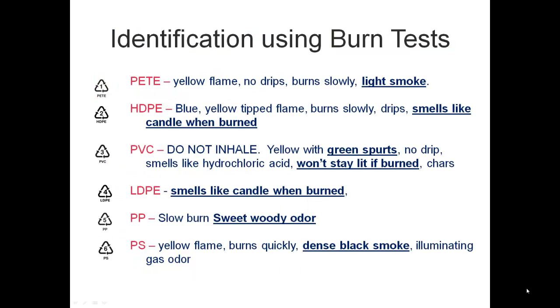Now this is a summary of what each of the different plastics that we've discussed will look like and smell like when put under a flame. So this is something for you to look at and consider. This is not something that you should try at home, because many of these plastics create a toxic smoke, and to burn them properly you really need to put them under a hood so that any smoke that comes out of it is away from you. So this is not something you should try at home. If you do try it in a laboratory, make sure that you have an approved hood where you're burning these various plastics.